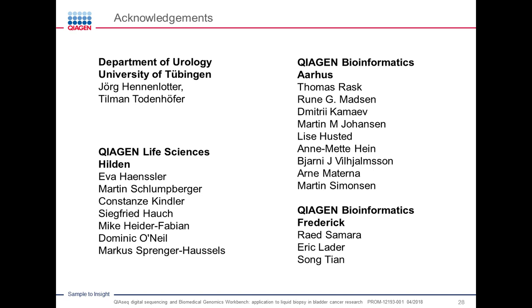Of course, the user can still decide to change any of the filtering parameters that I showed, for example, when I talked about the differential filtering of the different variants. So the user is still in control of what's happening in the workflow, but doesn't have to configure anything in order to immediately start analyzing the data.